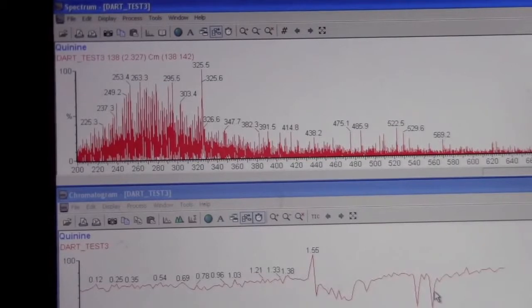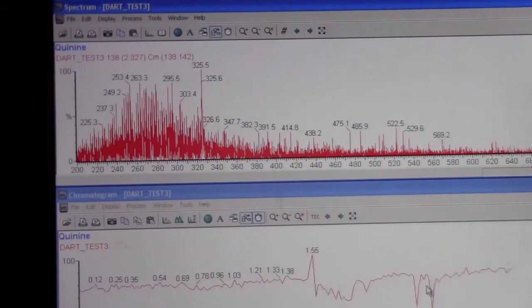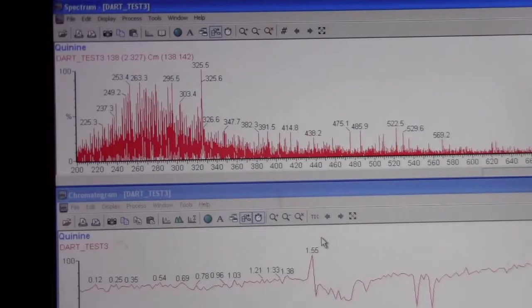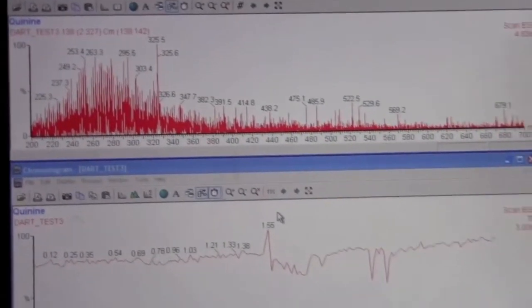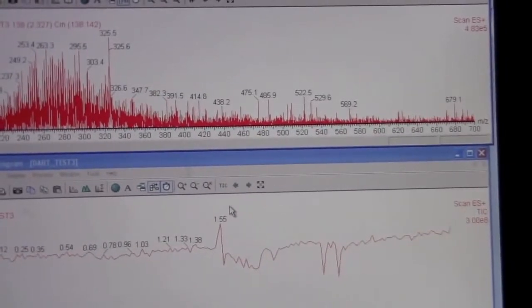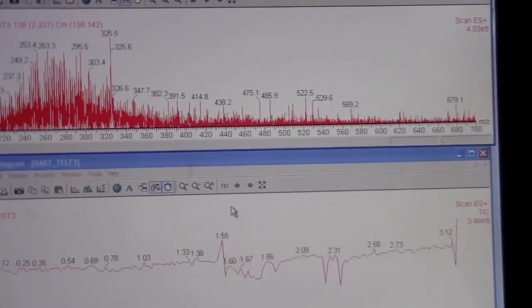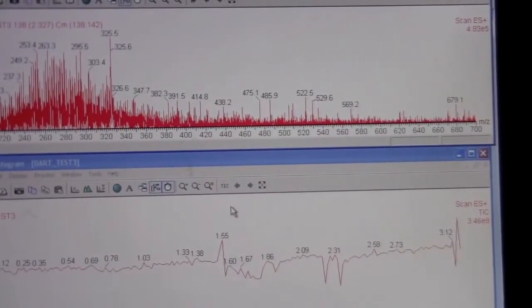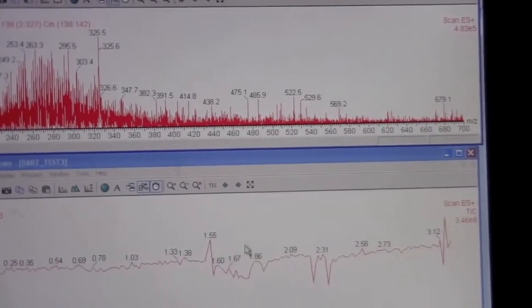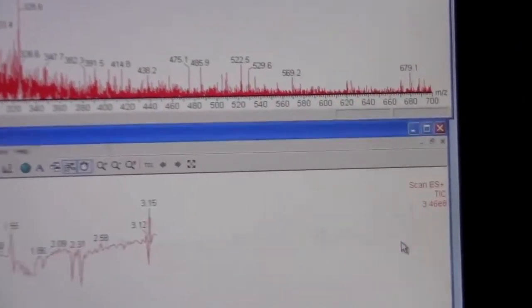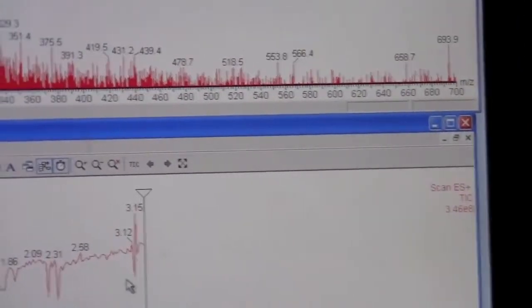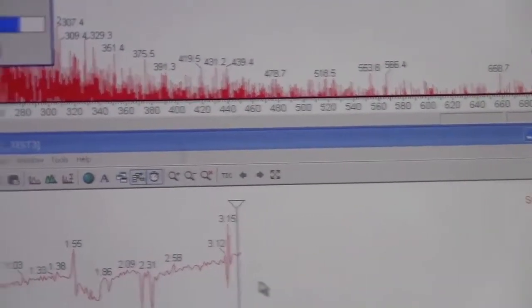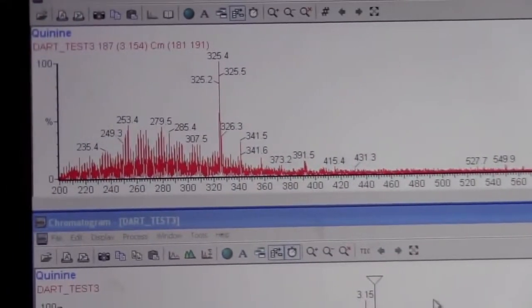Second time we put it through, most of the sample has already been ionized and put into the sample. So even though we see the dip, we don't see any more of the ion. If I dip it again and then put it through the stream, we see some effect on the trace and hopefully we will see our spectrum again.